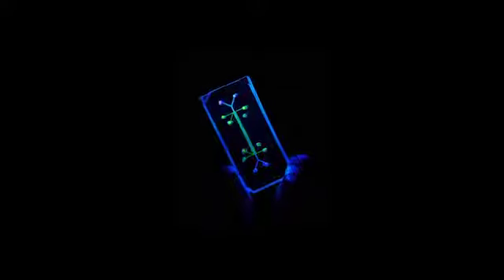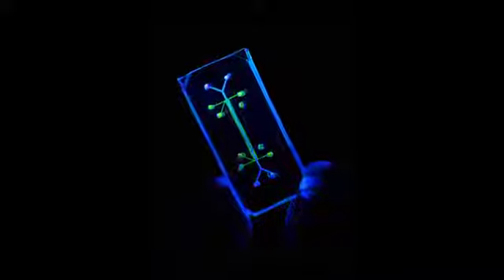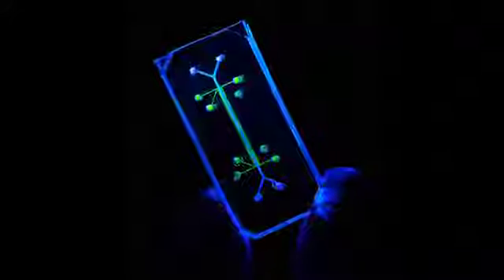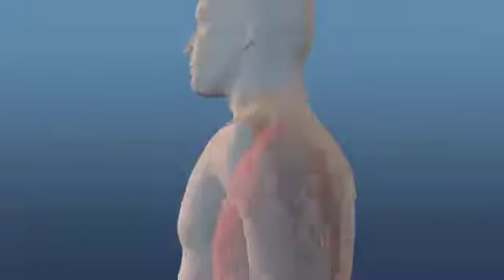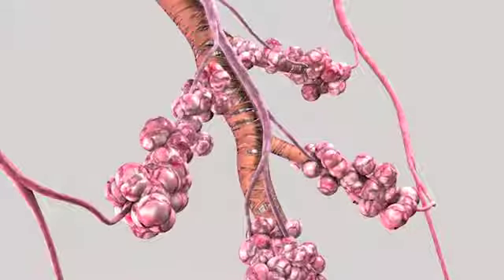The lung on a chip is a microdevice that has the potential to replace animals for the testing of drugs and toxins. The device, which is lined by human cells, mimics the mechanical and chemical functions of a living, breathing lung. With every breath, air enters the lungs, filling and expanding microscopic air sacs. Oxygen is transferred across lung and capillary cells and into the bloodstream.